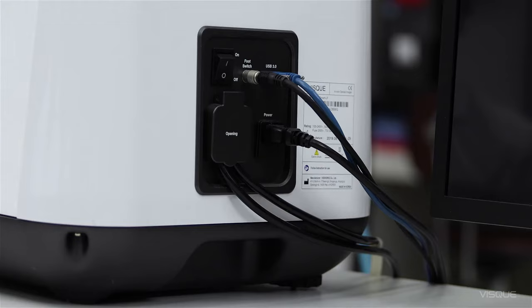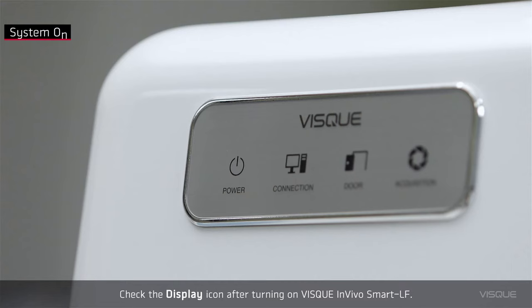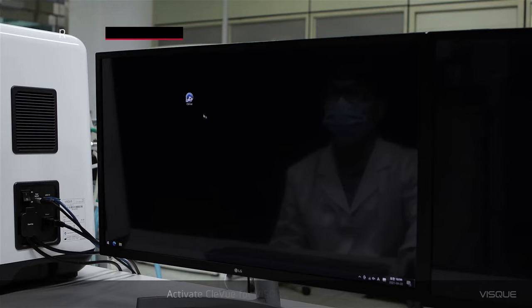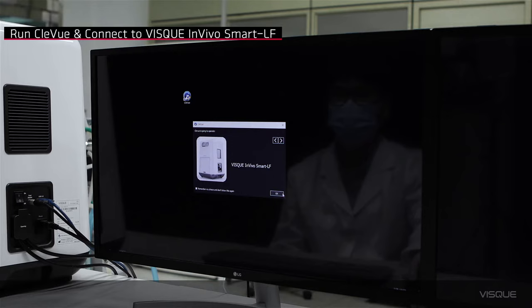Check the display icon after turning on VISQUE InVivo Smart LF. Activate CleVue for VISQUE InVivo Smart LF. From the Image Analysis window, select Acquisition to open a window for acquisition setting.